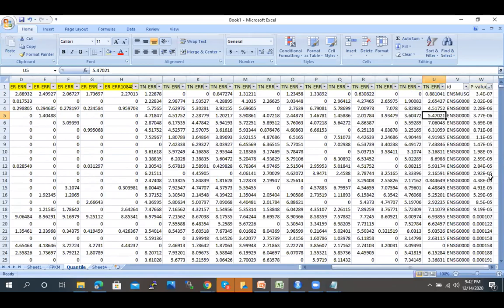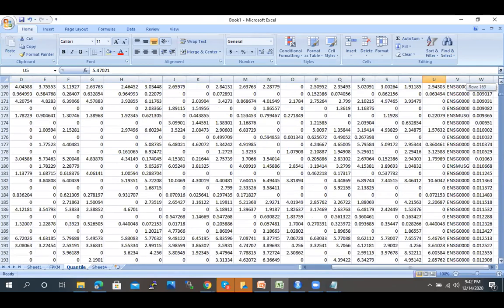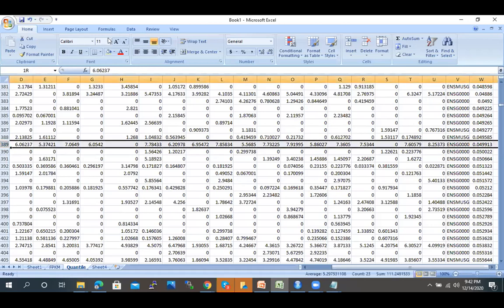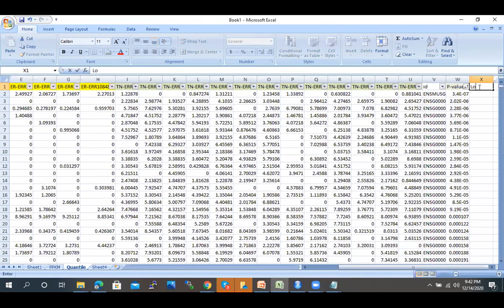If we are looking at just the p-value, till here, we have 388 genes which have a significant p-value. So we can filter out those genes. Then the next criterion in the t-test, what was that? That is log fold change.